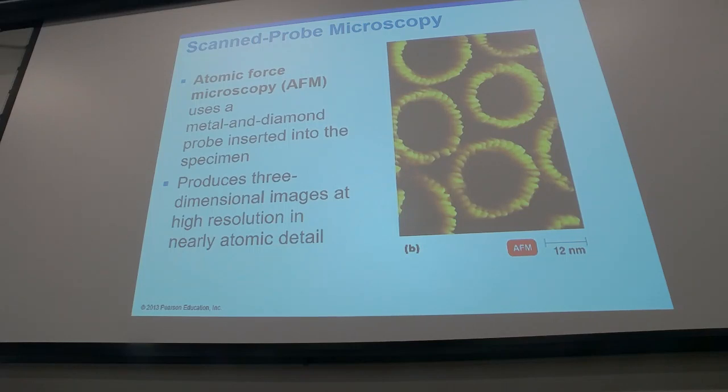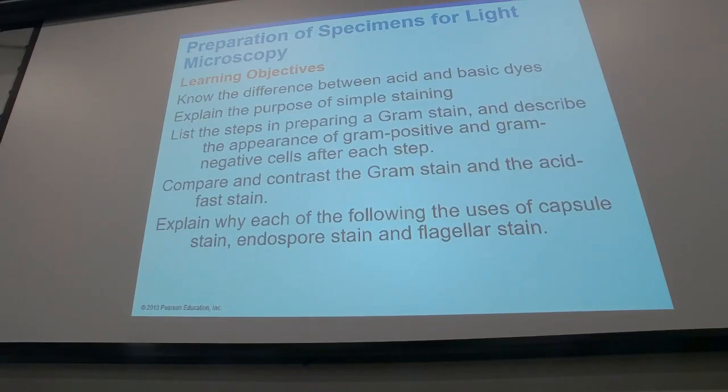These microscopes are very expensive. Not everyone can use them, only someone who is highly trained. But they give you very good resolution. I mean, what if one of these channels or porins was mutated and is closed? You can see it with this type of microscope.